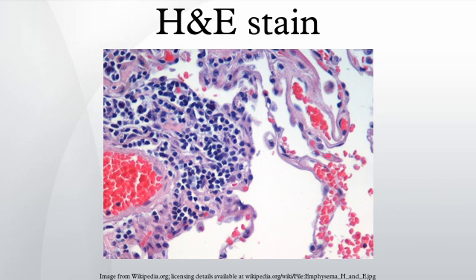The staining method involves application of Hemalum, a complex formed from aluminum ions and hematein. Hemalum colors nuclei of cells blue. The nuclear staining is followed by counterstaining with an aqueous or alcoholic solution of eosin Y, which colors other, eosinophilic structures in various shades of red, pink and orange. A mnemonic often used to remember the coloring process is: acidic attaches, acidophilic, applying auburn; and basic binds, basophilic, becoming blue.